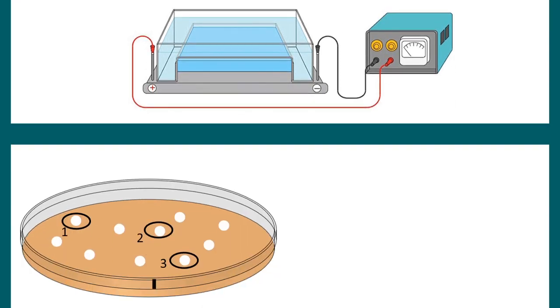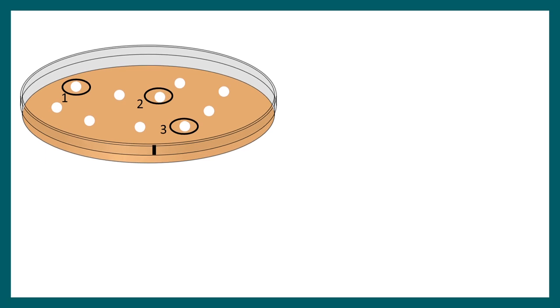Now what we are going to do is go back to the plate and scrape a little bit of colony number two again, and then inoculate that in a test tube containing bacterial culture media. Our goal is to amplify this particular bacteria and isolate the pure plasmid from that.